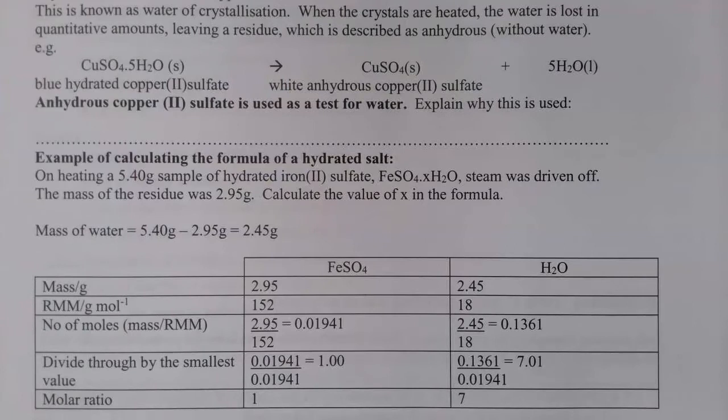So welcome back, and in this short video we're just going to be looking at calculating the waters of crystallization, and then we're going to look at a short experiment to find the waters of crystallization experimentally using hydrated copper sulfate. So we're on page 17 of your notes and we're looking at the formula with waters of crystallization.